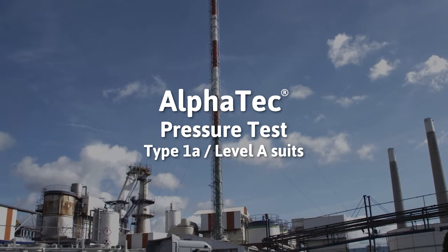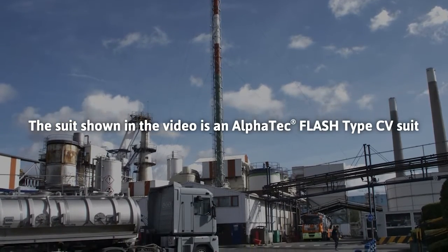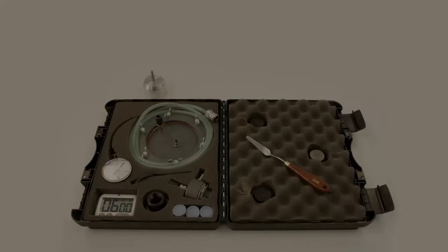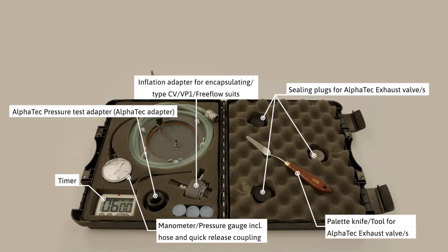In this video we will show how to pressure test an encapsulating suit. Check the content of your test kit to find the correct components for the pressure test.